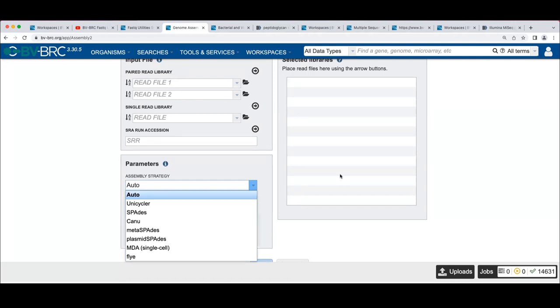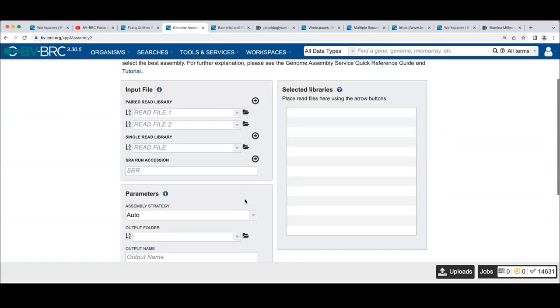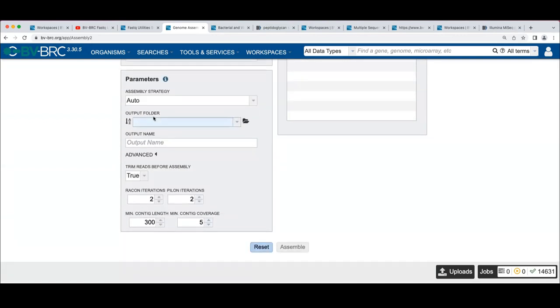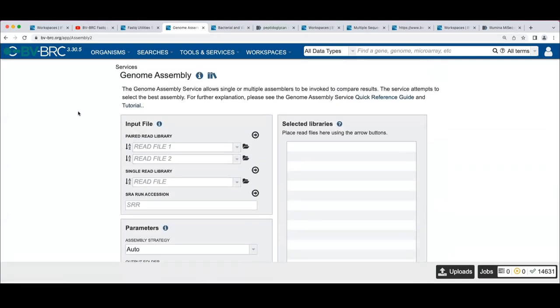If you had a metagenome, we've got MetaSPAdes. If you think your sample has a lot of plasmids, there's PlasmidSPAdes. There's also MDA for single cell, Flye for Nanopore, and advanced options below depending on your selection. There are also polishing steps — read polishing is essentially a normalization of errors in an equivalent column for a set of reads.